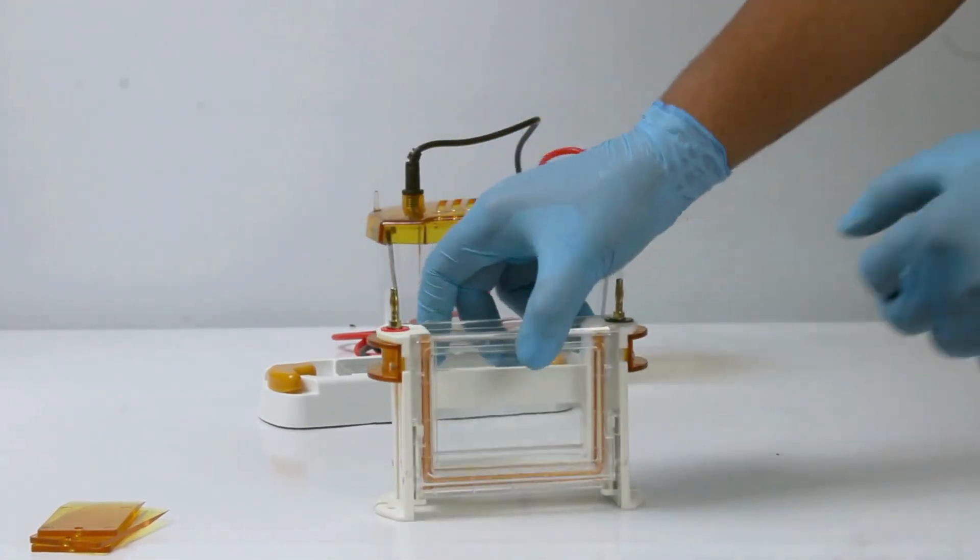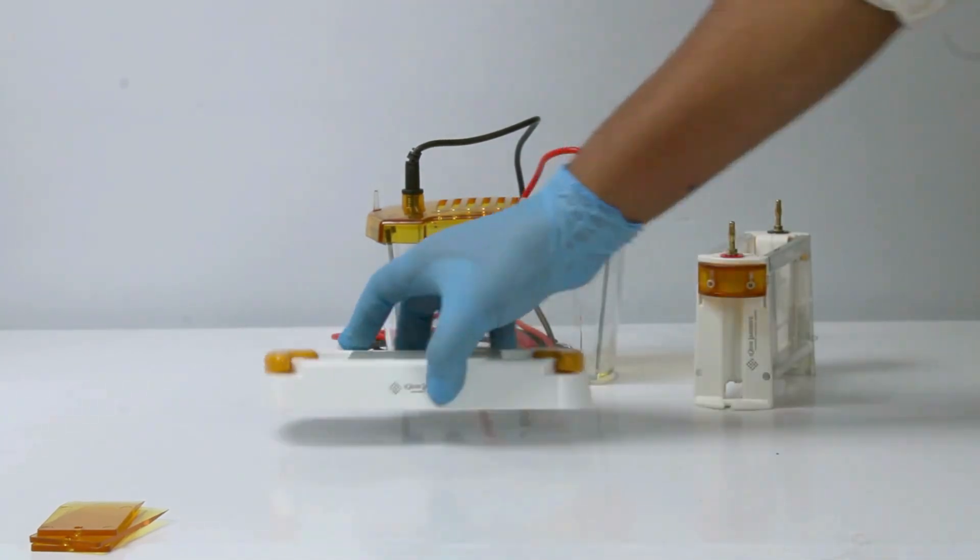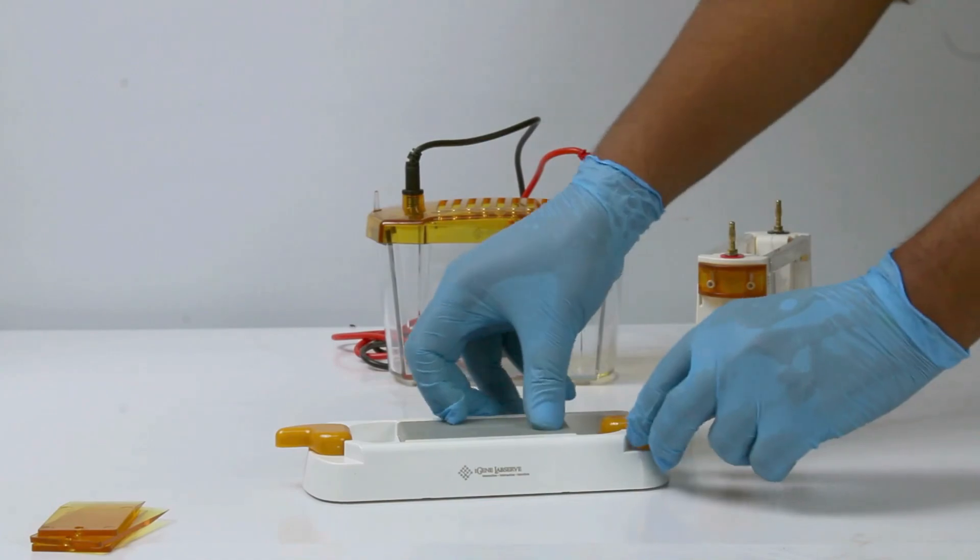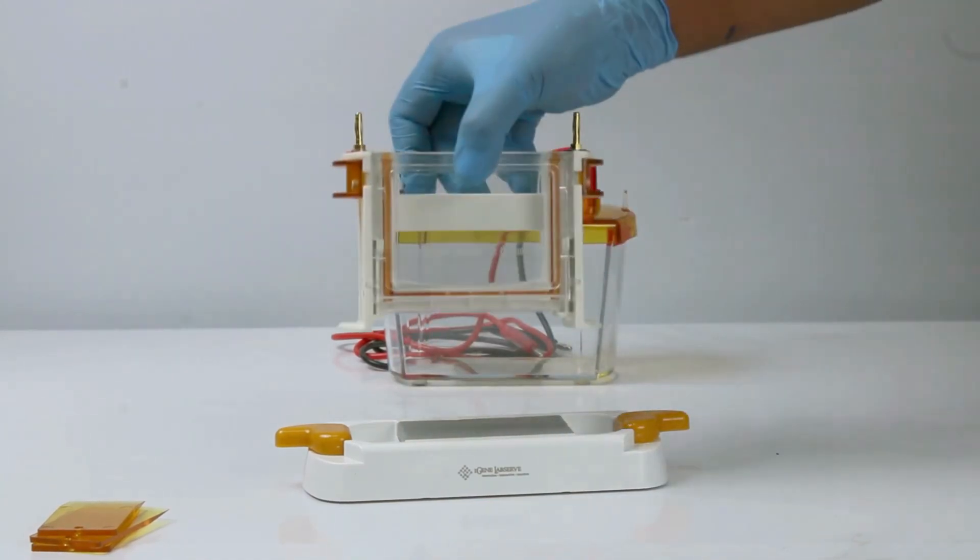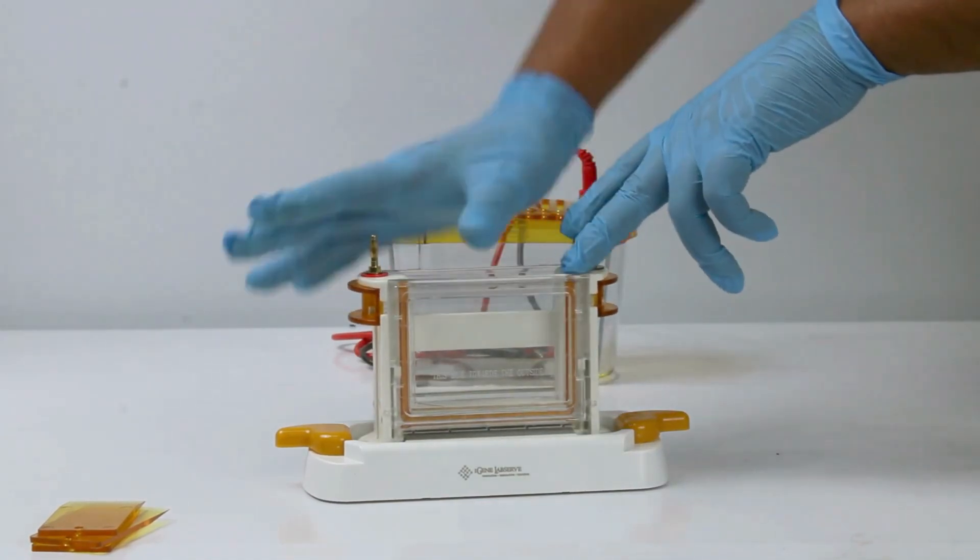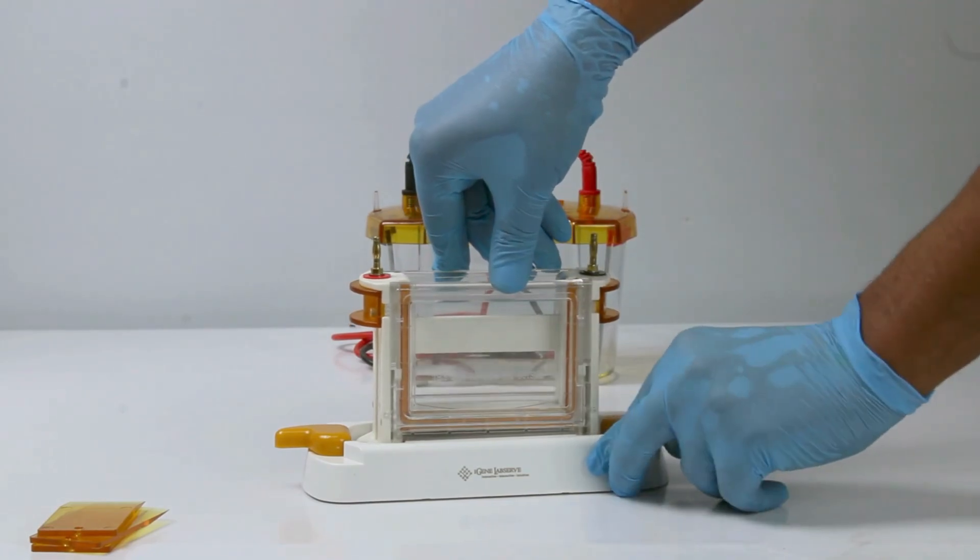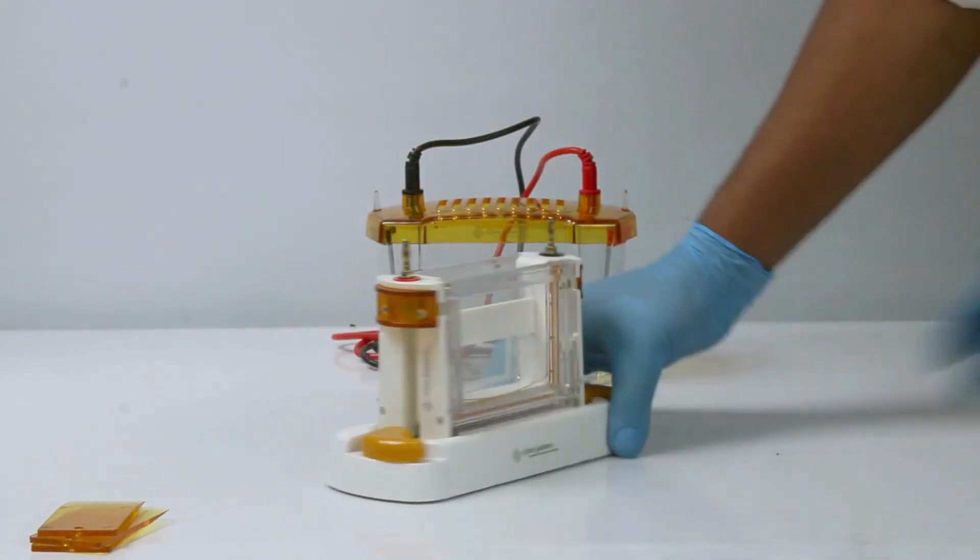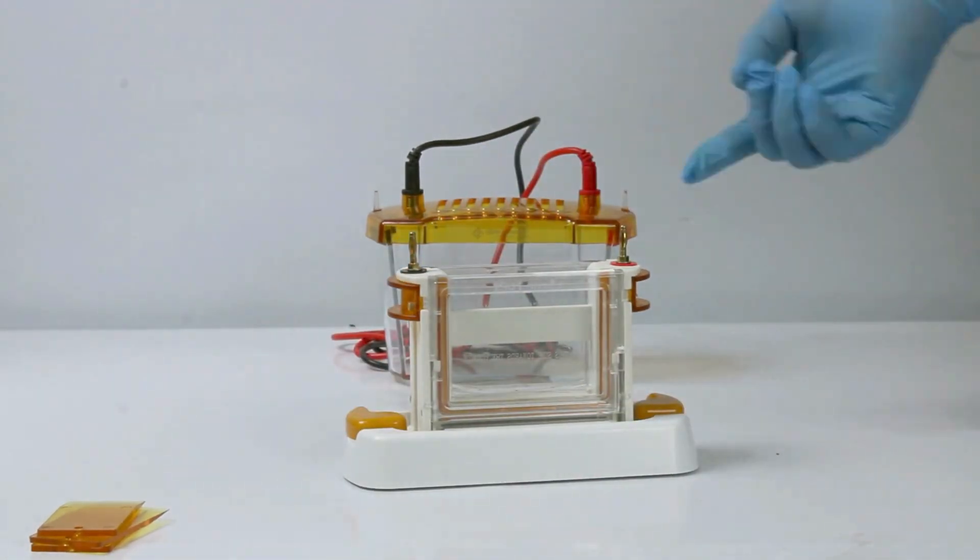Place the electrophoresis bracket into the gel making base holder. Loosen the knob by rotating them outward. Position the bracket in the center. Press it down and tighten the knob on both sides until fully secure.